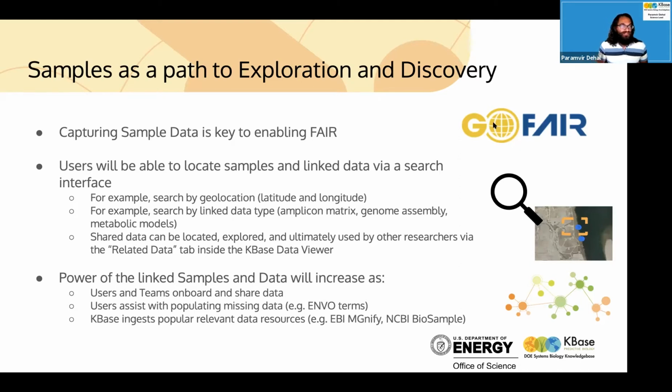We're developing user interfaces so that users will be able to link data and locate the data through search. So you can do a more complex query, and find data not just by its name, but by its geolocation, or geolocation plus additional information about what data is linked to it.